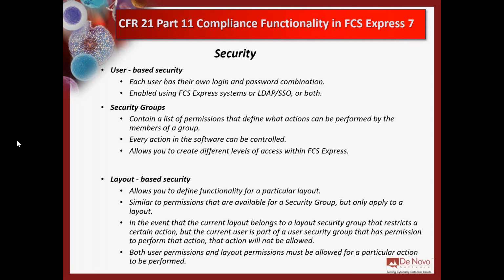So you can set up a number of different security users, you can assign them to different security groups, and at each level, they'll have different access to different functionality in the software. And really, every action in FCS Express can be controlled. You're going to see this when we pull up the security group list or the permissions list, that really every single click on a button in FCS Express can be allowed or disallowed for any level of user. So you can create different levels of access for different levels of users within the software.